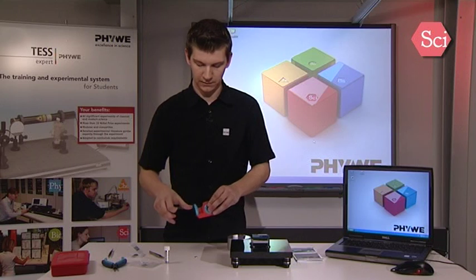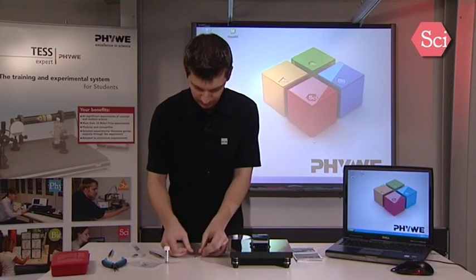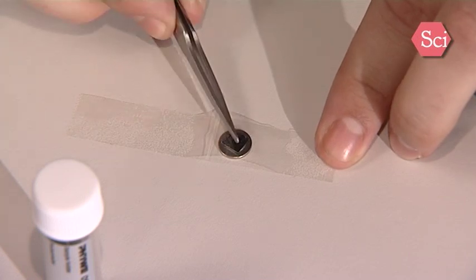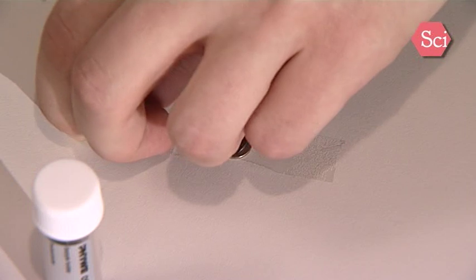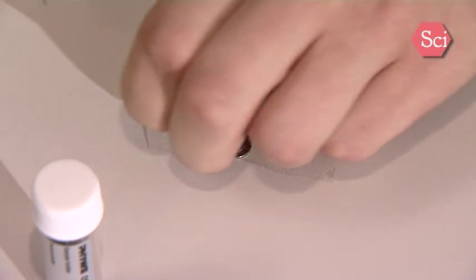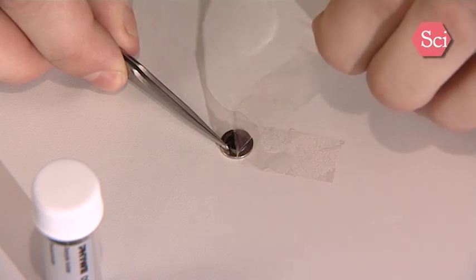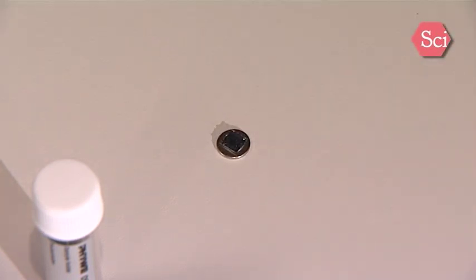Take a long stripe of tape and put it on the sample. Apply some pressure. Hold down the sample to the table with the flat tweezer tool and peel off the upper layer of the graphite sample.